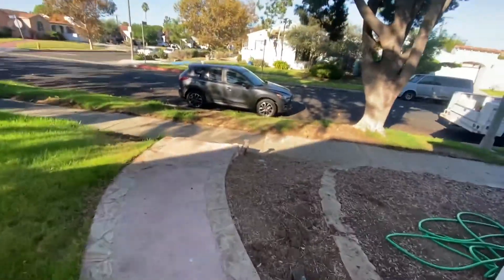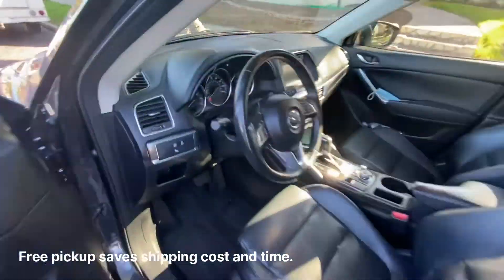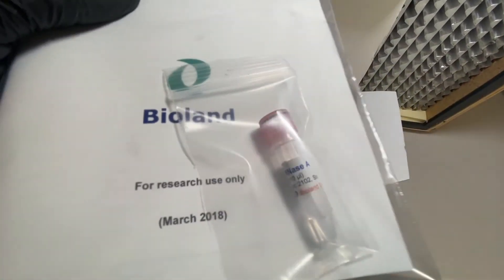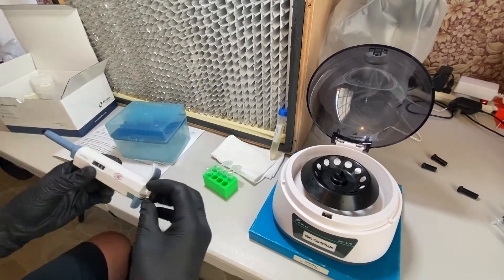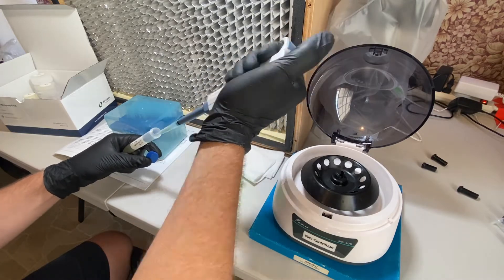Since I needed a new kit anyway, I decided to take the plunge, buy the kit, and rerun the plasmid purification steps to see if that fixes the electroporation and transformation issues. Here's a preview of what this kit looks like: some instruction manuals, RNase A that I'll need to mix in, and all the different reagents and spin columns for extracting the plasmid DNA.